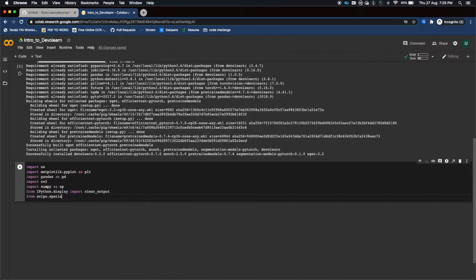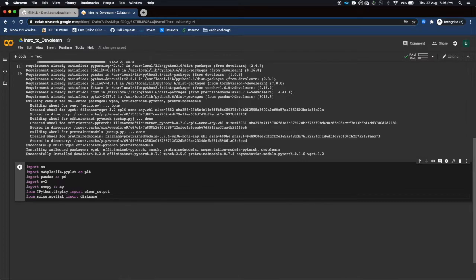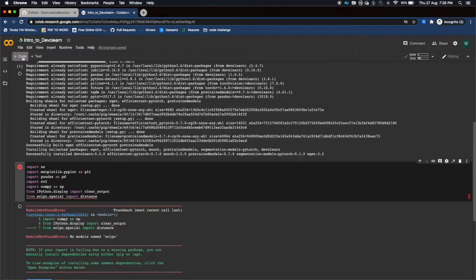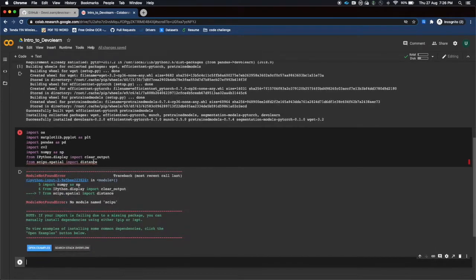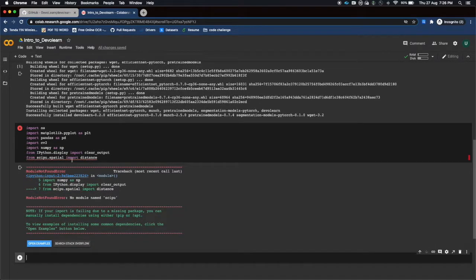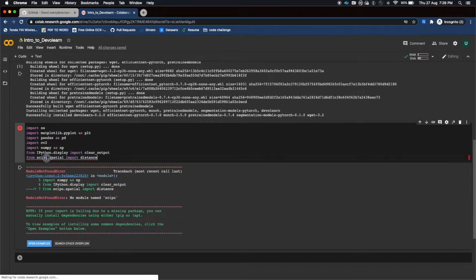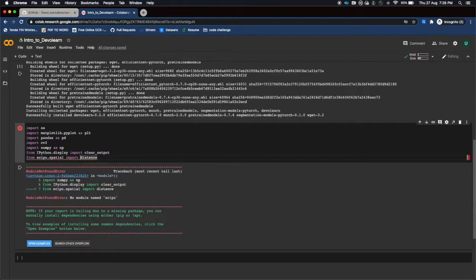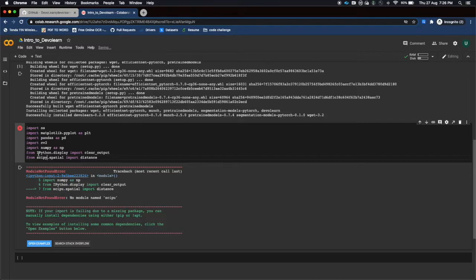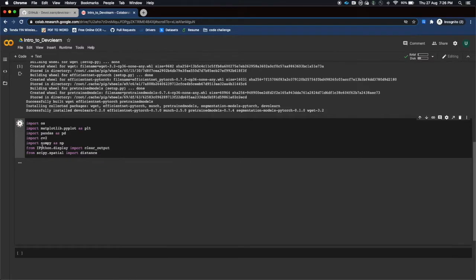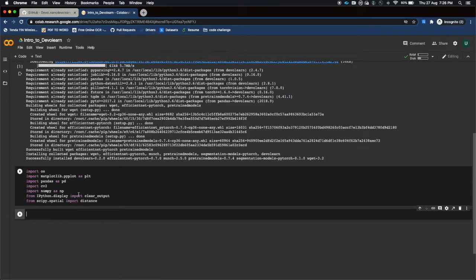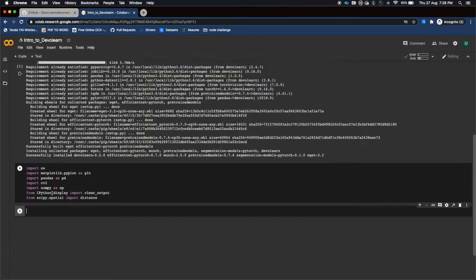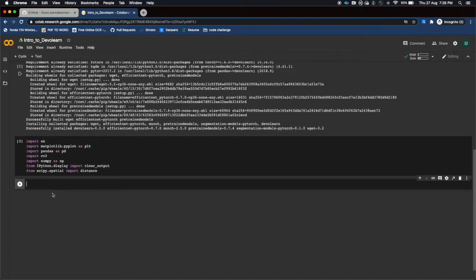Most of these tools that I am importing are basically to visualize things. Let us import these things. Oh, we get an error. That's a typing mistake - these things can be avoided. I think this should work. All the library packages are pre-installed and these are all things are done.